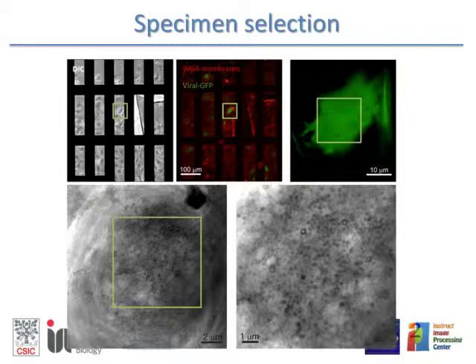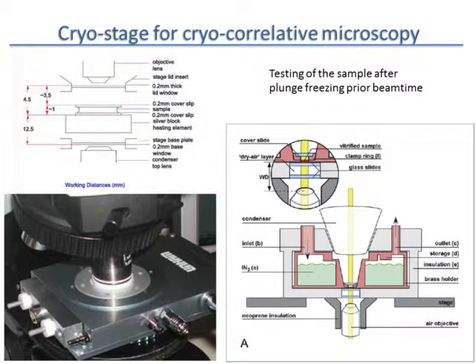So I am really able to follow things with the optical microscope, with fluorescence, taking profit of cellular biology developments while I go into the high resolution structural biology part. How do I do it? Well, I suggest two approaches. The first one is the one we do, and is probably the easiest one. It's just a cryostage. That is a device where you put your grid, with the liquid nitrogen and everything, and you see it here with the microscope.